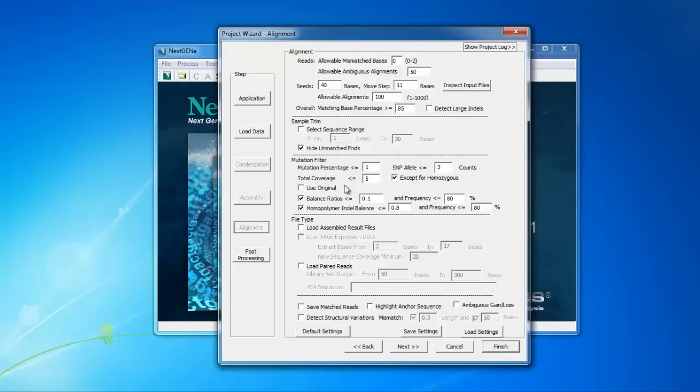The Total Coverage setting is the requirement for the total coverage depth at a position to call a variant. The default value is 5. In many cases, and especially for lower frequency variant detection, you may want to increase this to a higher value, for example, 100.